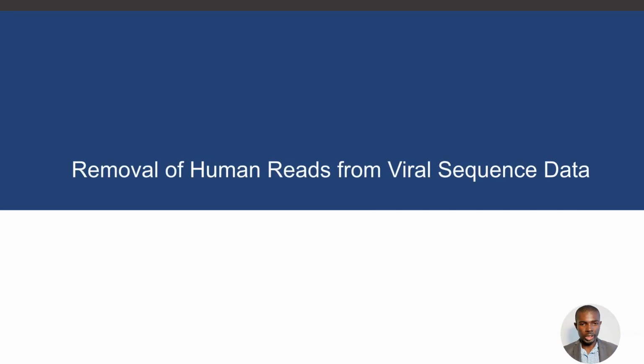In today's video, I'm going to show you how to remove human reads from viral sequence data.